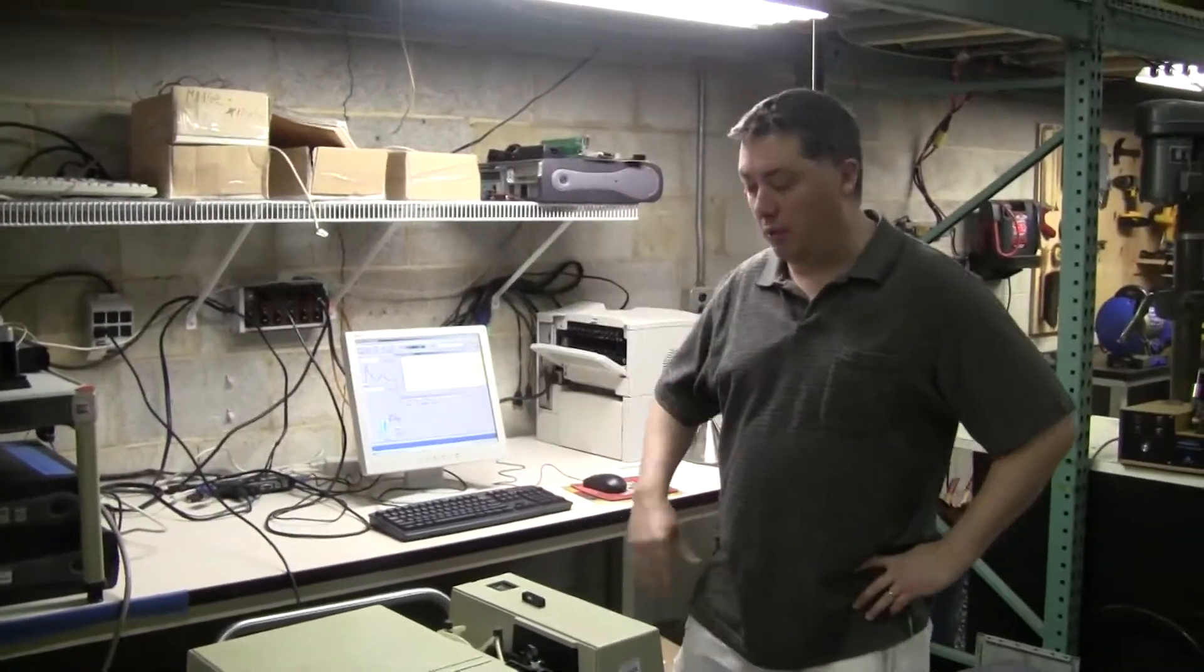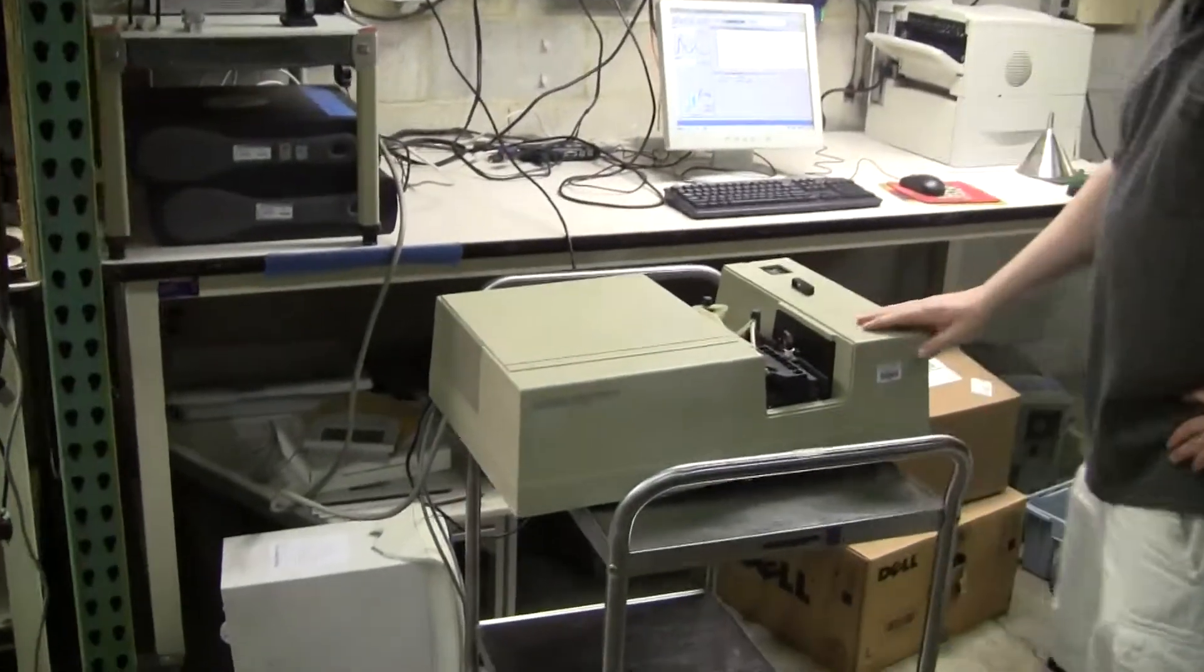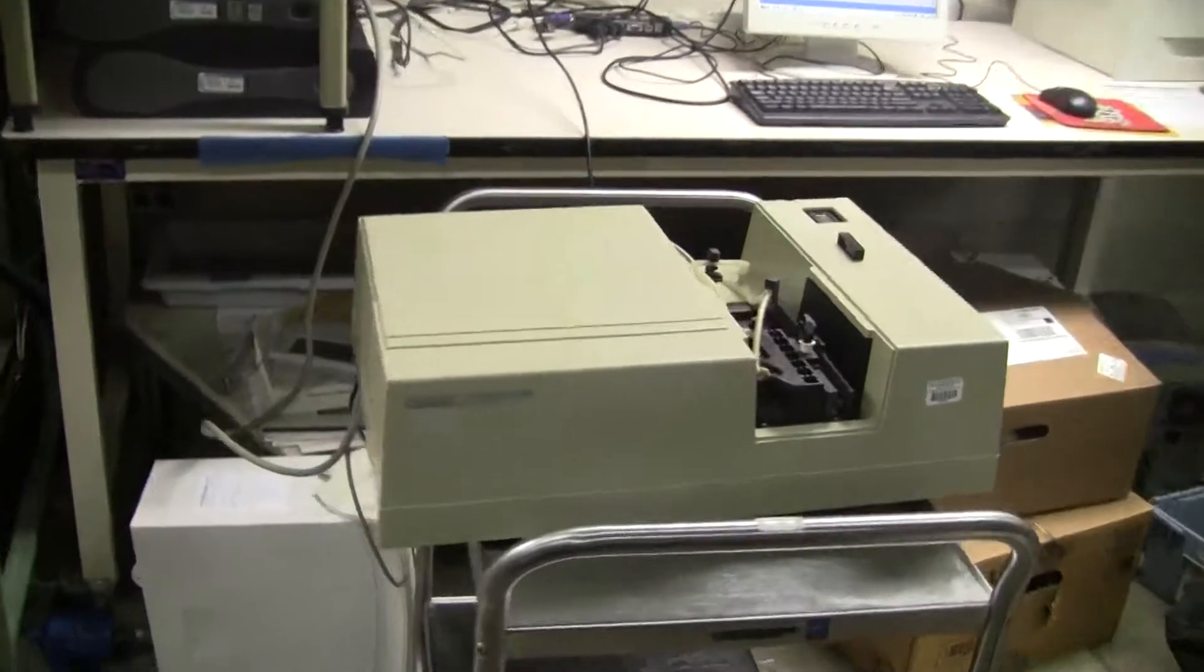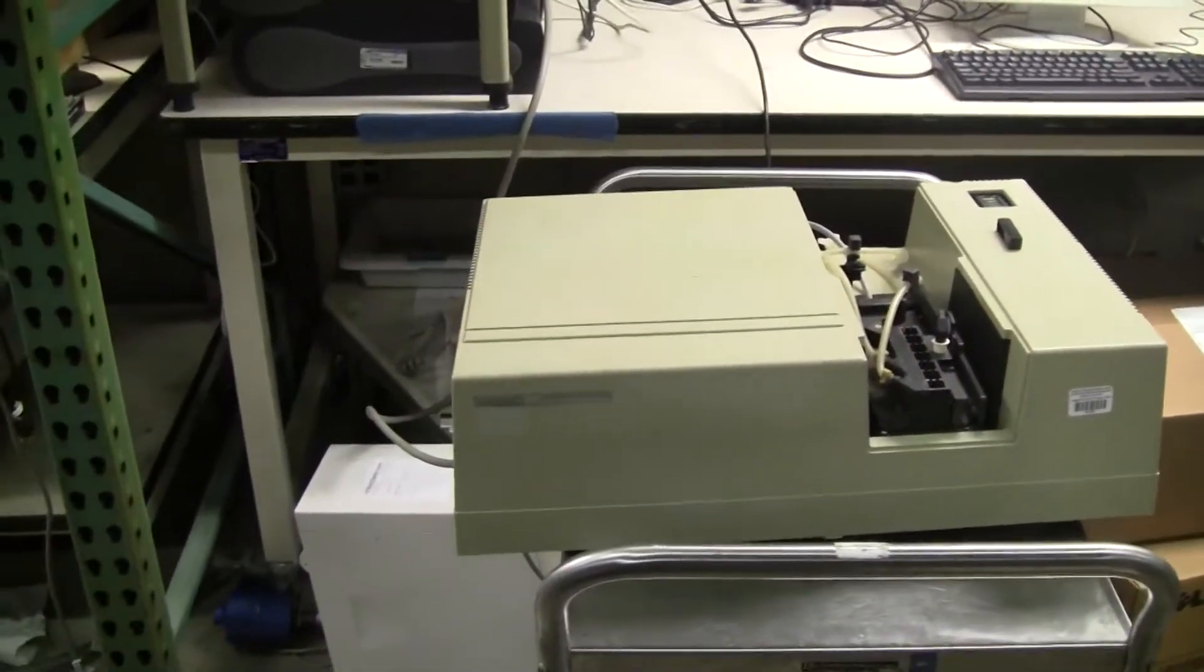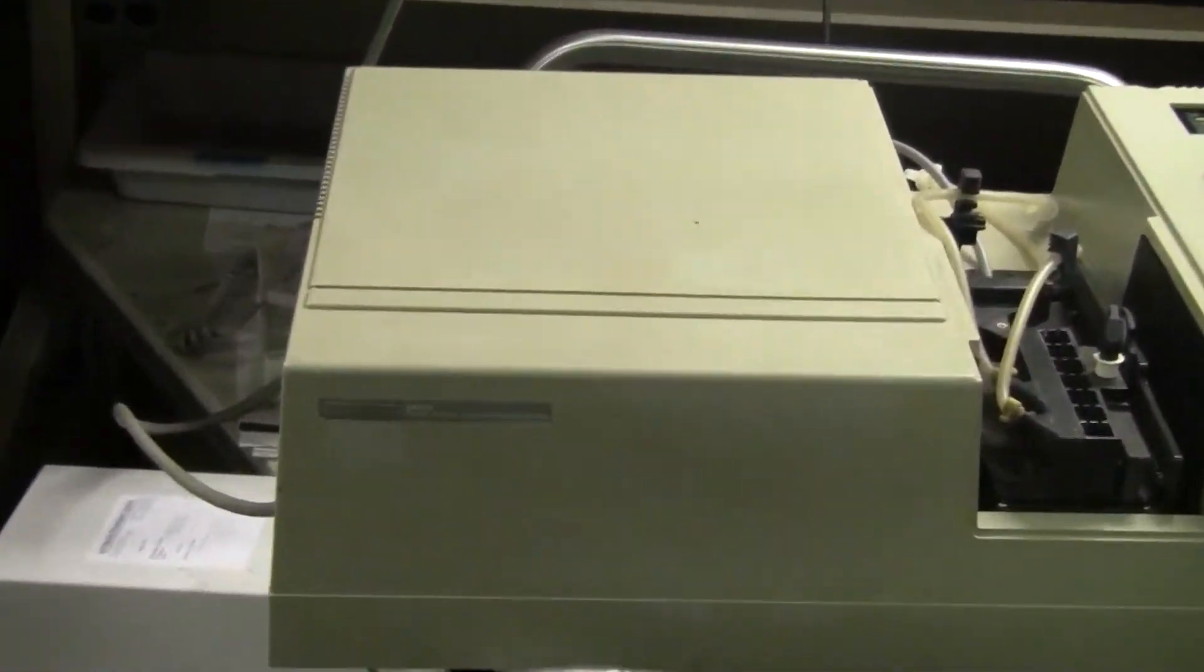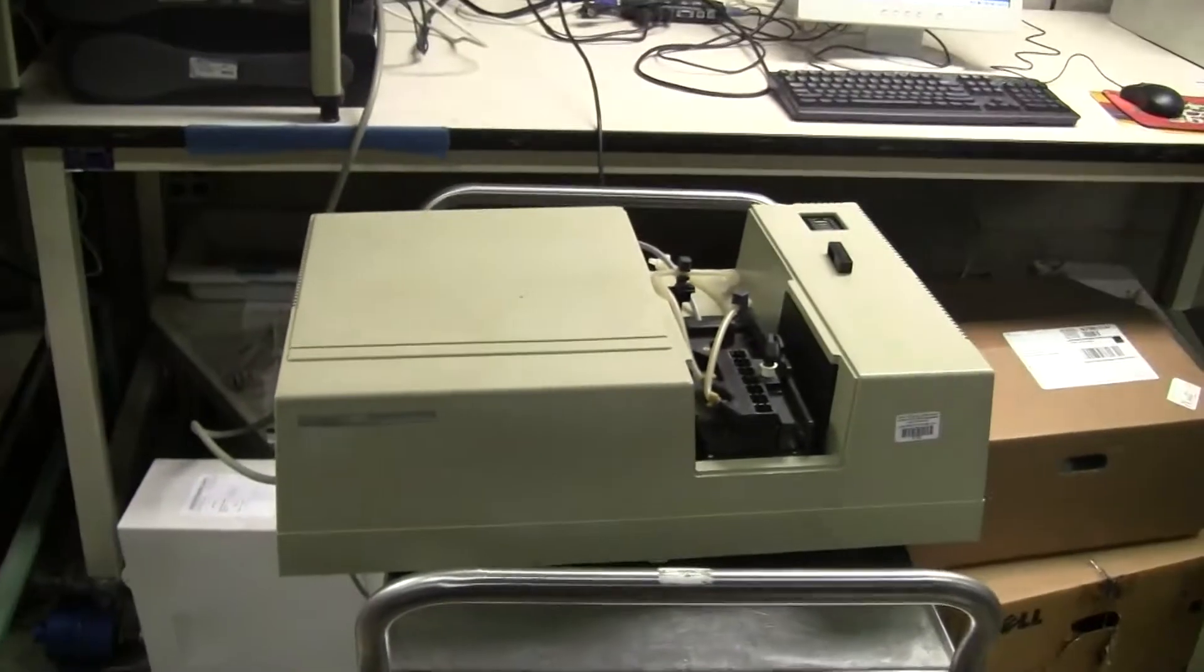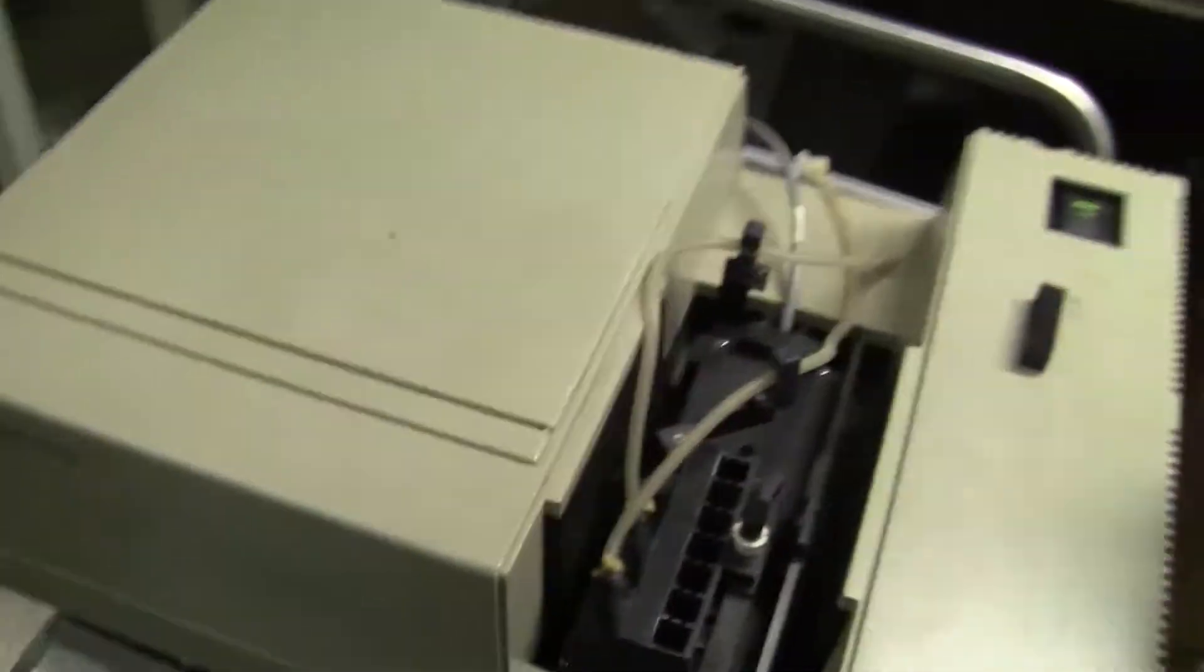Hi, this is Michael Natal from Hi-Tech Trader. Today we're looking at a spectrophotometer manufactured by Hewlett-Packard Agilent. It is an 8452A diode array spectrophotometer.